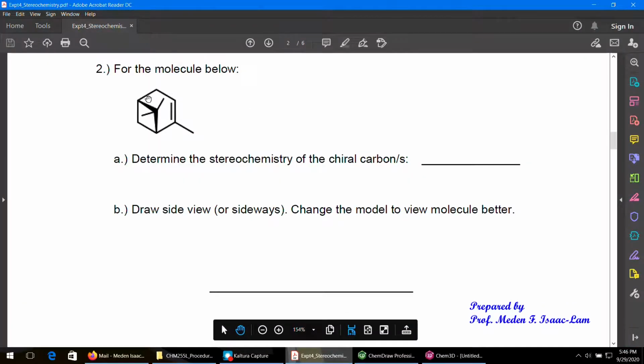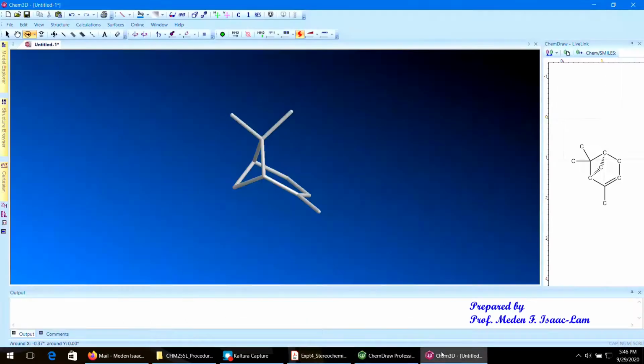This is viewing it on top. So this is actually protruding, coming up towards you, and this is on the plane of the paper. However, in the side view, which is this, you are looking at it this way, while this one now is on the side. So it's like the peak, and then this is the side. So you're gonna draw it this way.